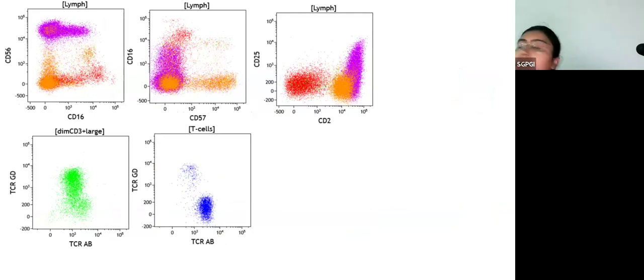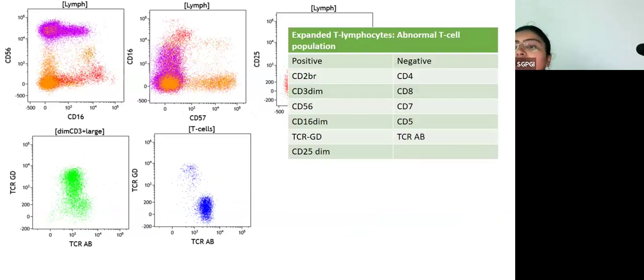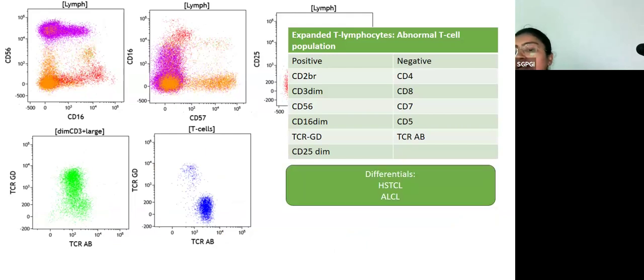If we have a look at all these markers, now the CD4-CD8 split seems to be more in favor of dual negativity for our abnormal population. We also look at other markers here. These dim CD3 positive cells are expressing CD56. They are expressing a little bit of CD16. As expected, they are CD2 positive. These cells also expressed TCR gamma delta. In this case, what are the differentials? It is a CD4 negative, CD8 negative, very blastoid abnormal looking tumor with a dim expression of surface CD3.